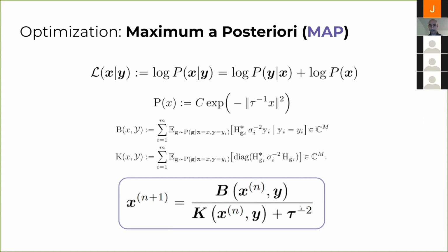It's quite amazing. And what this says is this is basically a Wiener filter. And what it says is that tau, that was our confidence in our data, if tau to the power of -2 is very small, then you have very high confidence in your data in the B here, and you end up allowing it to migrate into your next guess at a much higher level.